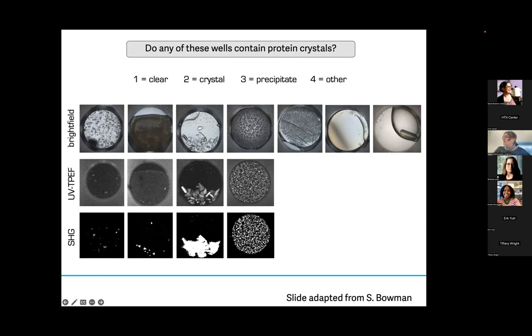All right. And well, number 5, again, we're split between protein crystal and precipitate. Some say other. Let's take a look. And also protein crystals. So these appear to be microcrystals as well. All right. Well, number 6, some say protein crystal. Okay.